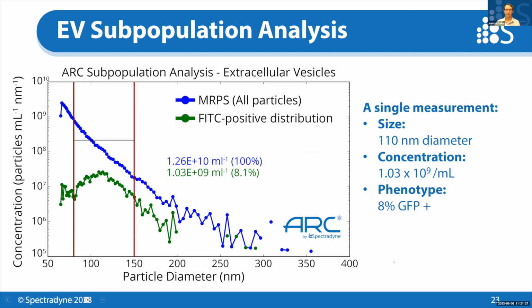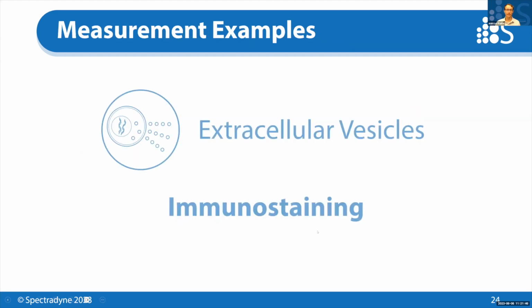Okay, so if this is your active ingredient in your science experiment, this allows you to accurately control for the dose in the different test systems, and really get an accurate comparison of your different formulations as you're doing your science.